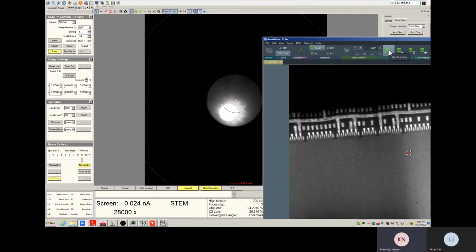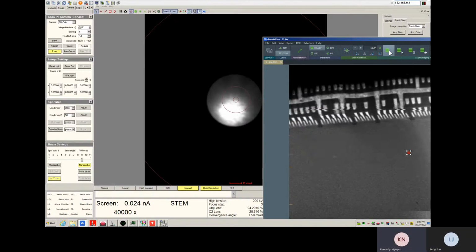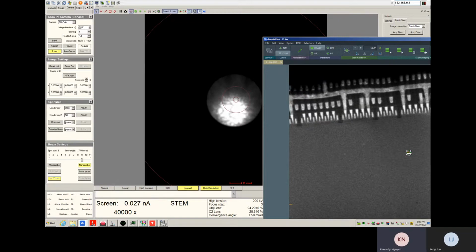So for convergent beam, the spots are all bigger and all brighter, right? Yeah. But the distance between them is about the same. The distance between the spots is definitely going to reduce, because the spots are going to overlap with each other. There's no distance between them.